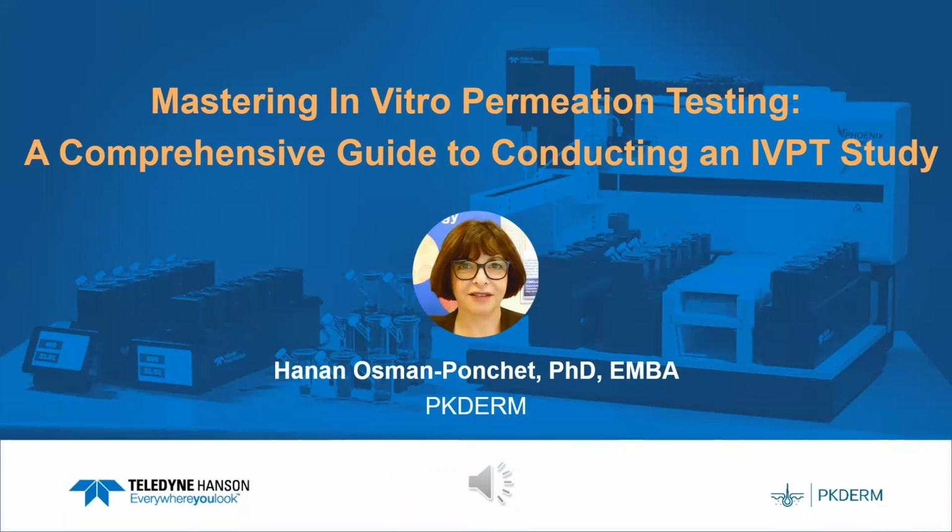You will see during this webinar how to prepare skin samples, how to prepare diffusion cells, how to make topical application, and finally, and this is the most important step, how to separate stratum corneum, epidermis and dermis at the end of treatment period. So let's go.